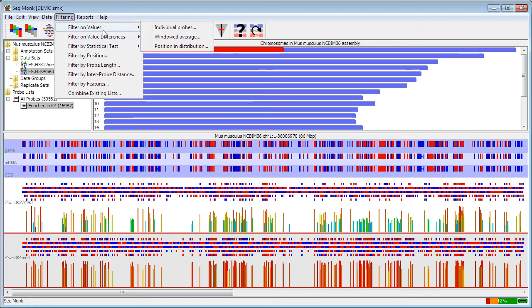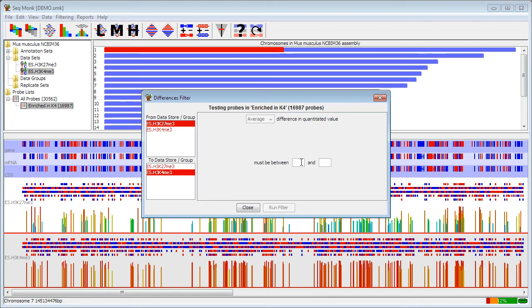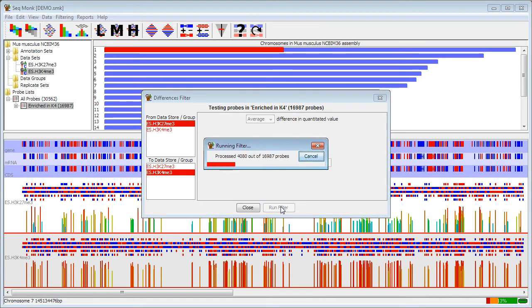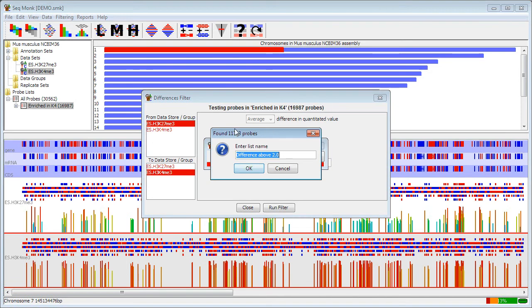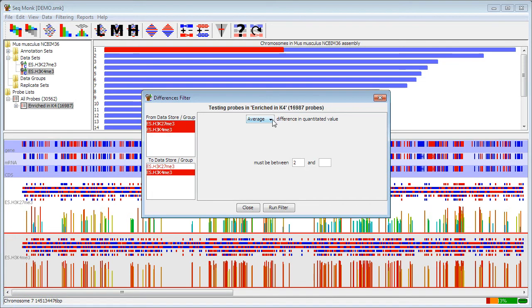Rather than filtering on values, you can also filter on value differences, either individually or in a window. In this case, instead of selecting one data store, you select two data stores, and then you can specify the size of the difference between those data stores. Here I'm looking for probes that are specifically enriched in K27 above K4. If I had more than one data store selected in either of these groups, that would then perform all the pairwise comparisons possible, and I would then be prompted to say whether I wanted to filter on the average difference, the maximum or the minimum difference.